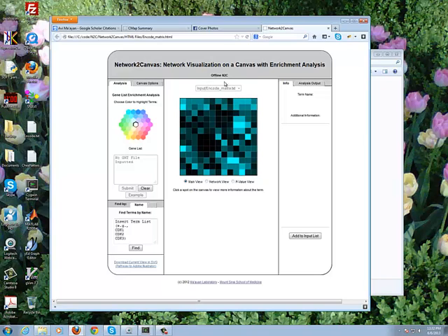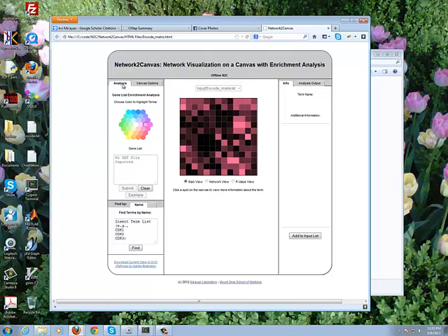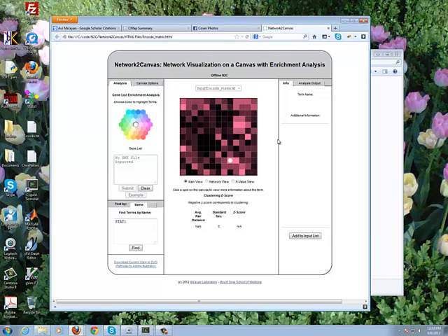This is a version of network-to-canvas offline and now we can interact with this particular object. We can change the colors of the canvas and potentially we can highlight specific terms. So for example, if we want to highlight STAT1, we can type here STAT1, and then it finds it and then we can change the color of STAT1. So on this canvas the areas that are bright are areas where the transcription factors share a lot of target genes or target transcription factors with their neighbors.